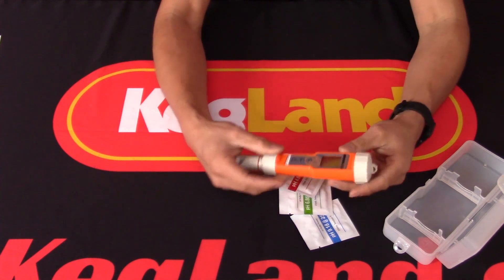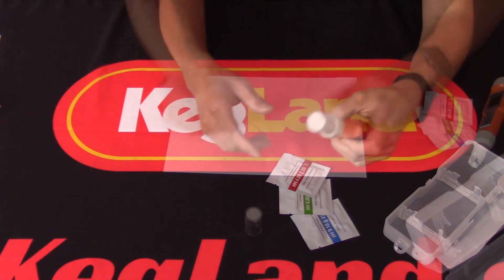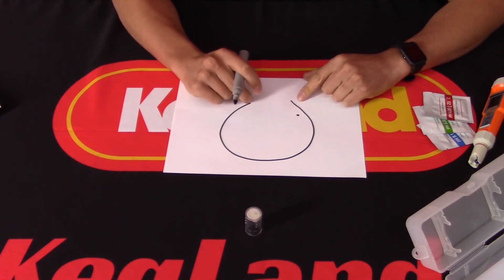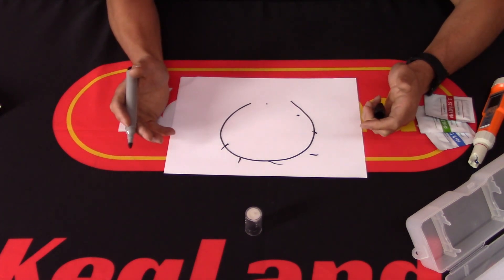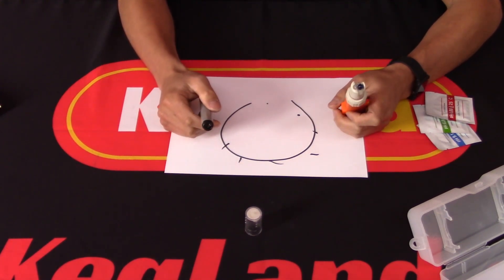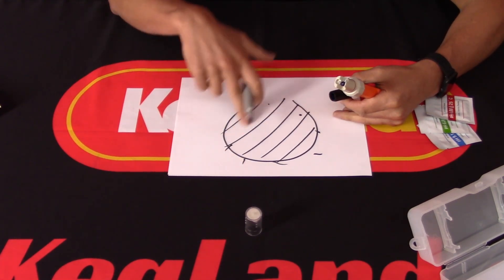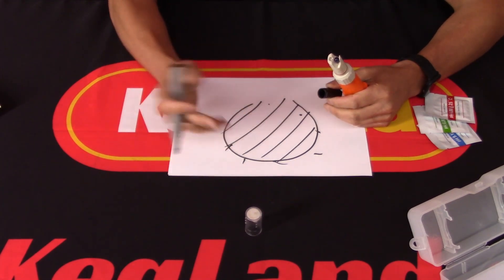One of the really important things is making sure we have a replaceable probe. Inside the probes there's a bulb on the end with a very fine glass membrane — it's so thin it actually has to be permeable in order to get a reading. You've got a KCL solution inside the probe, and if you let the probe dry out, the concentration of KCL will change and the solution will eventually evaporate into the atmosphere, causing the probe to cease to work.